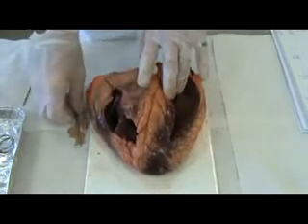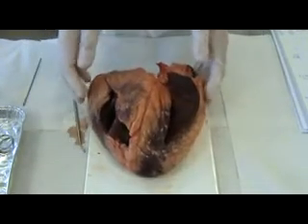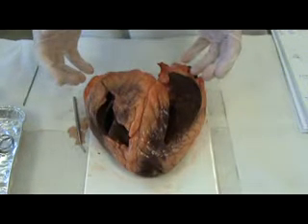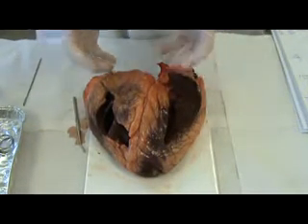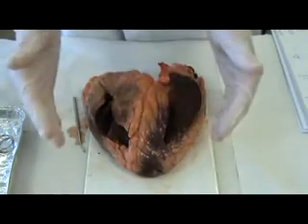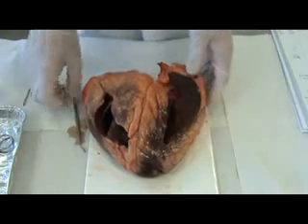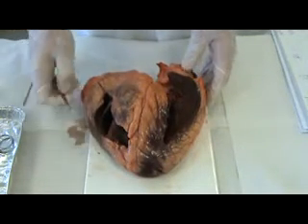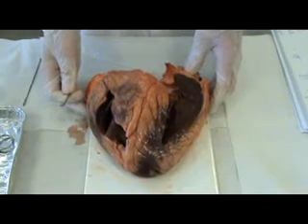The two atria fill with blood, and then when they contract, they force the blood into the ventricles, which then together fill with blood. So this creates a good rhythm to the heartbeat, a coordinated heartbeat.